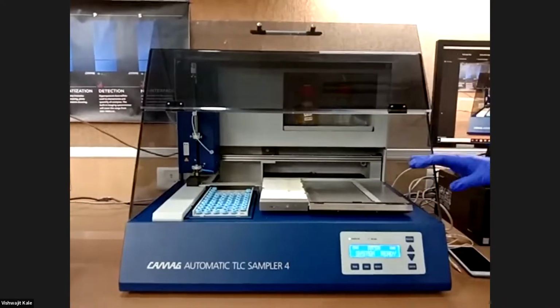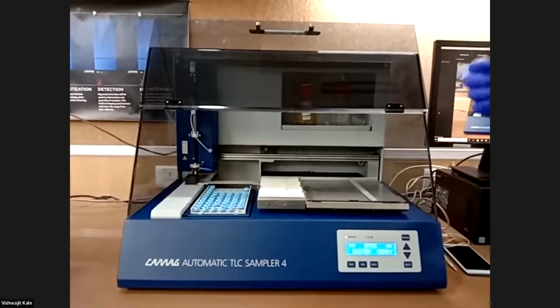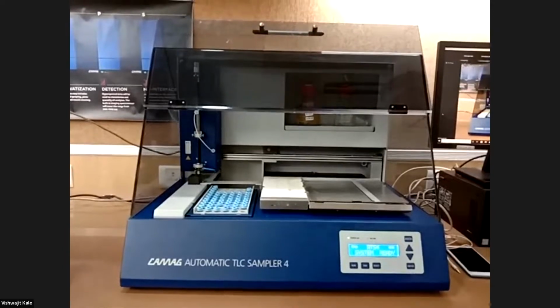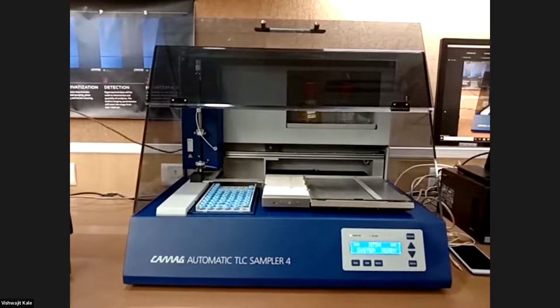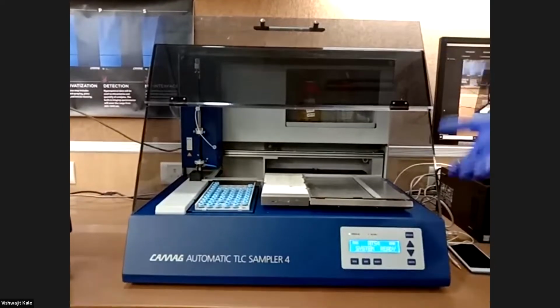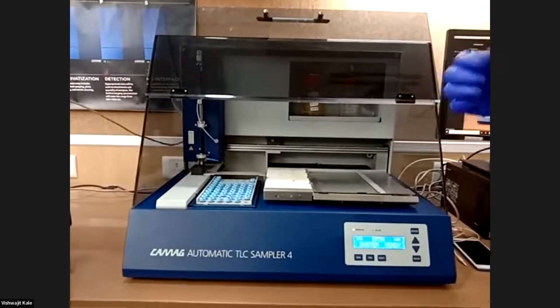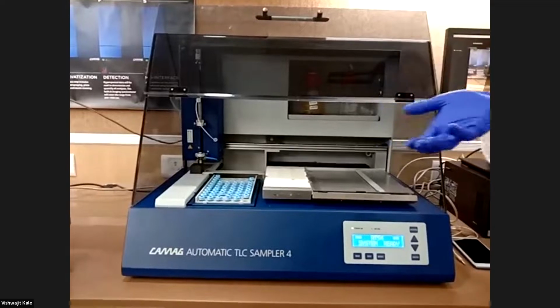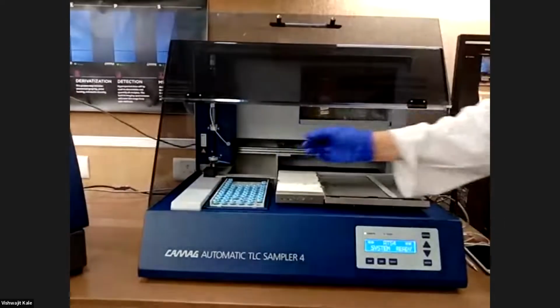We are using compressed air or nitrogen gas to generate a very fine spray of our liquid sample. So in HPTLC, we are dealing with liquid samples. We need to prepare the sample in liquid form. We require hardly a few microliters of sample for HPTLC analysis. A clear, transparent liquid sample solution is preferable, because we are using these syringes in HPTLC applicators.